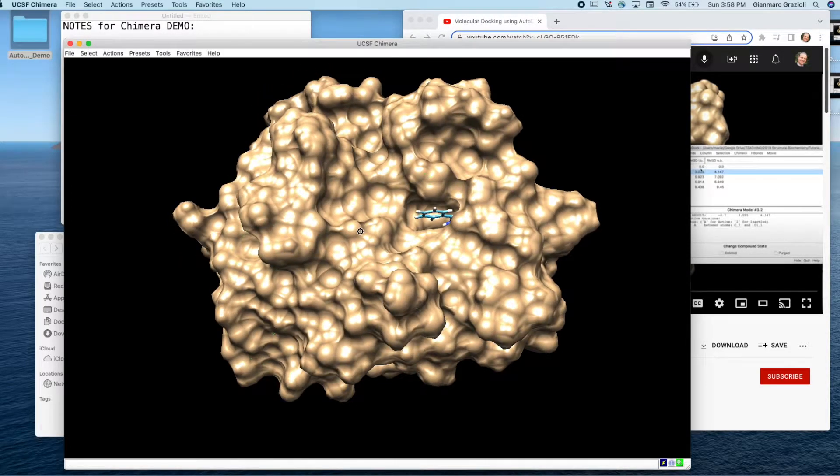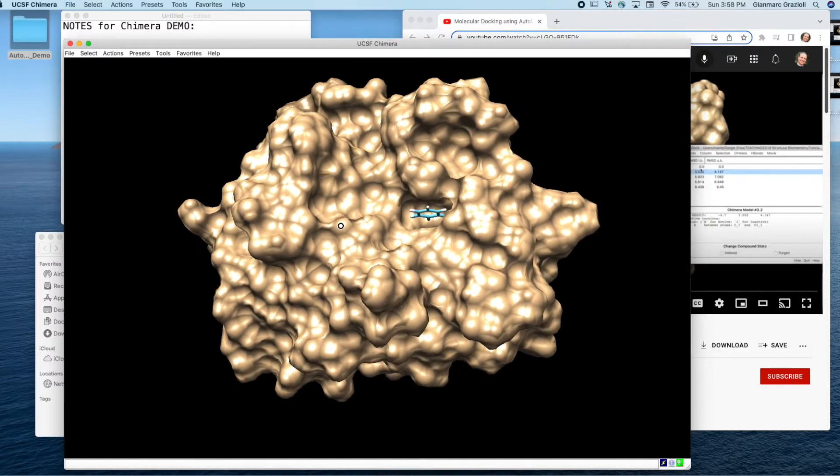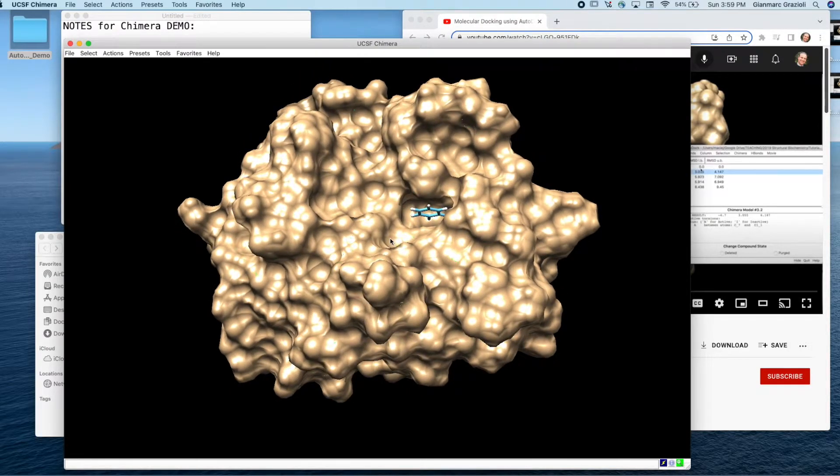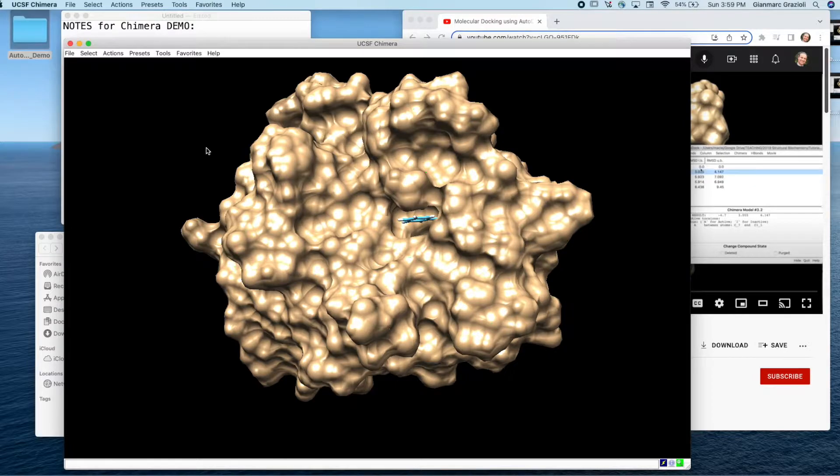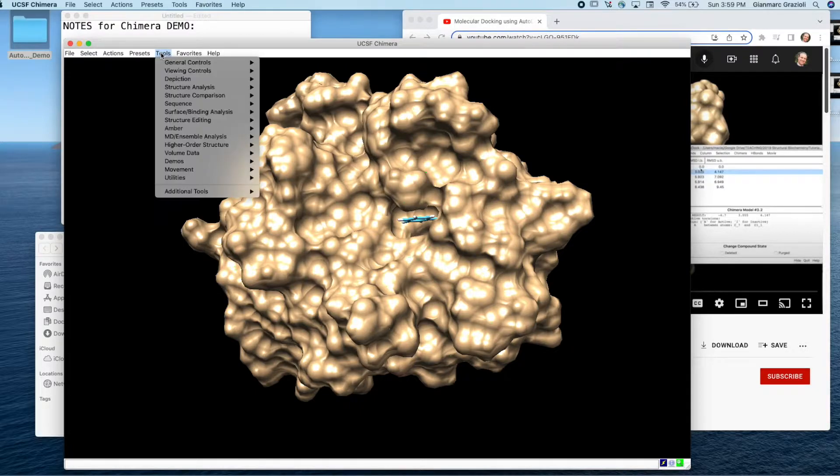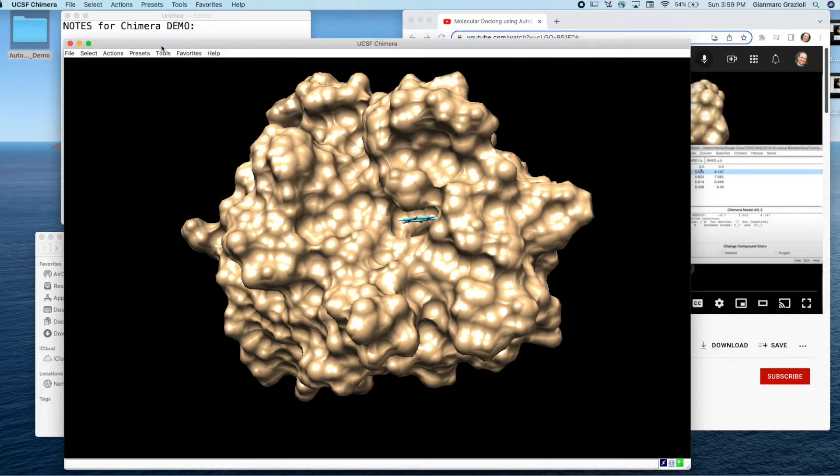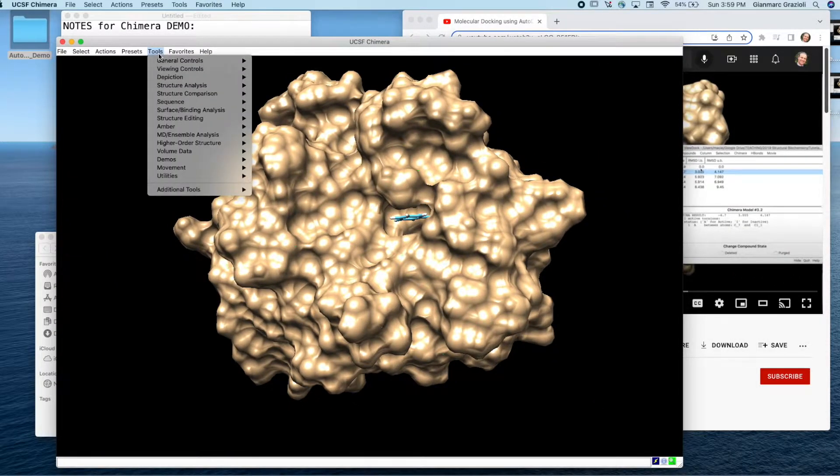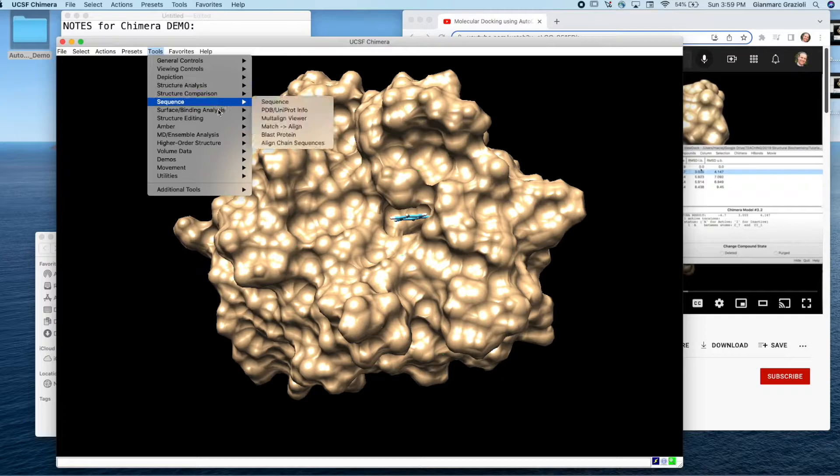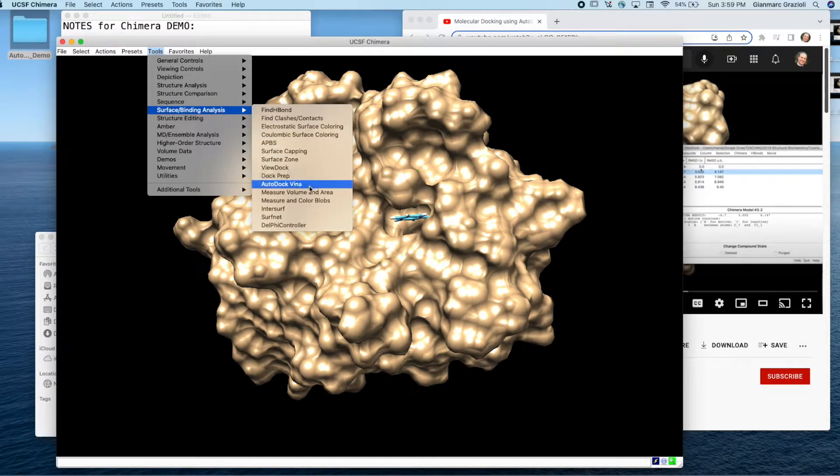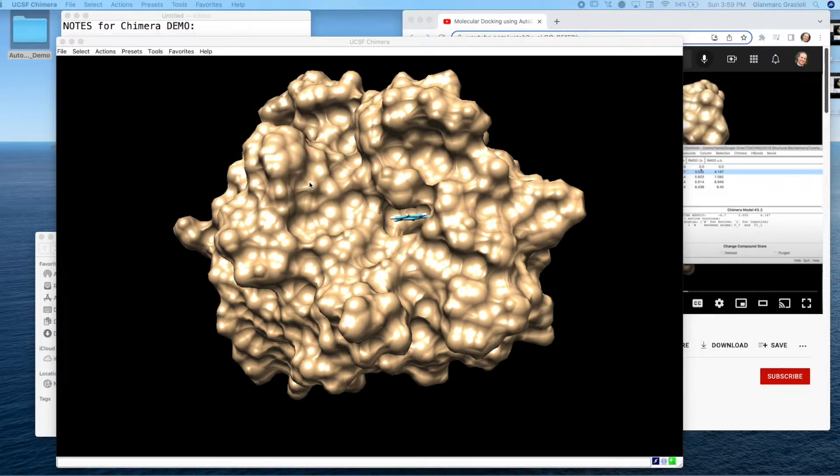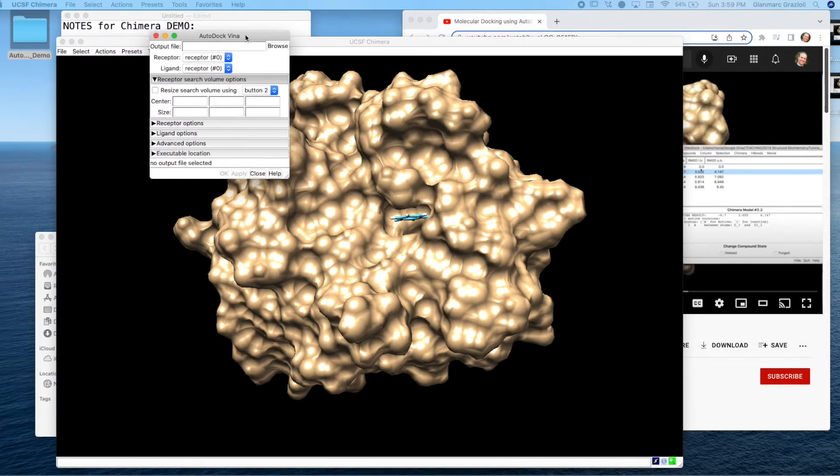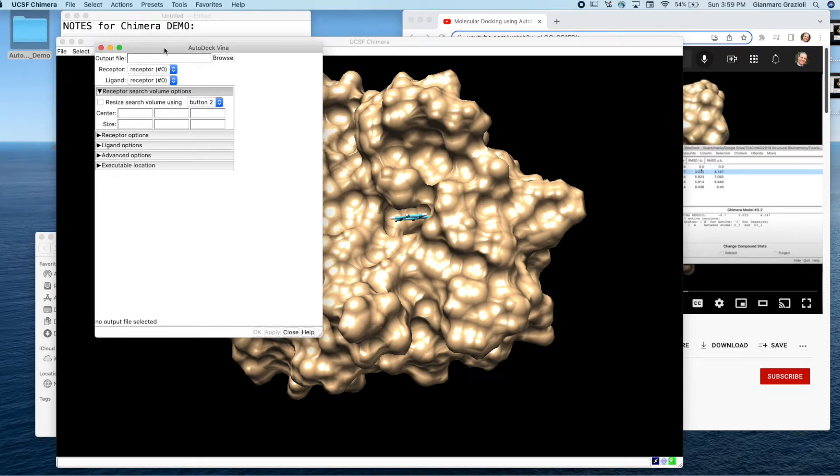So now we want to start trying to do some docking with this. If we go to tools and then if we go to surface binding analysis, there it is, Autodock Vina. Click on that. So tools, surface binding analysis, Autodock Vina, and then this little thing will pop up. This is how we set up the Autodock Vina.